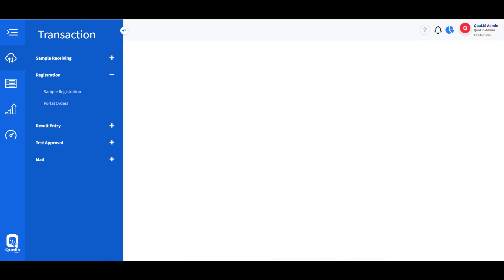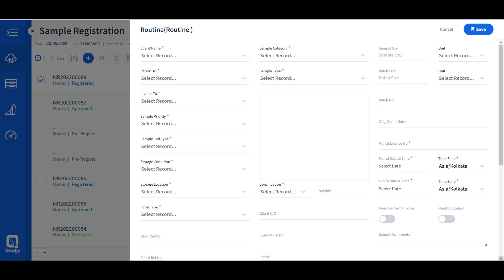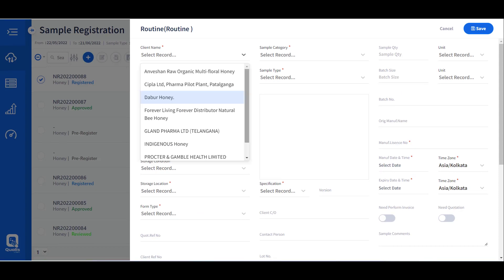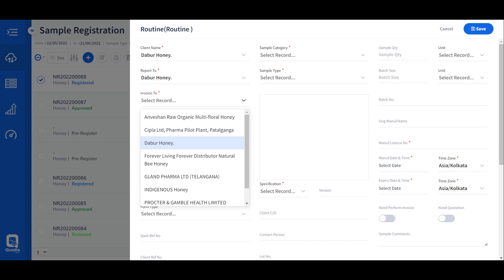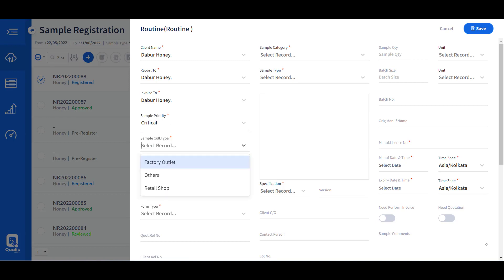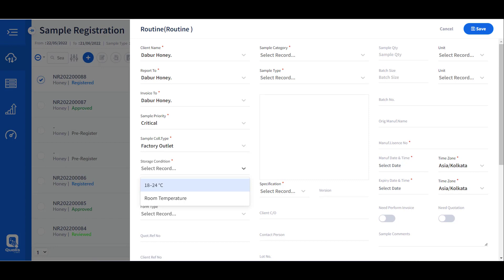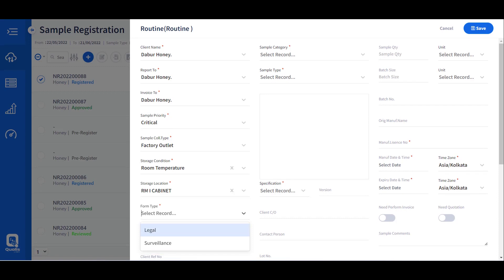Let us quickly walk through the sample management and sample life cycle. The first step is registration of the respective sample. Call SLIMS provides multiple formats for registration based on the type of registration required. Each format has its own metadata fields to appropriately associate sample information. Certain fields are marked with an asterisk as mandatory fields, while the rest are optional.